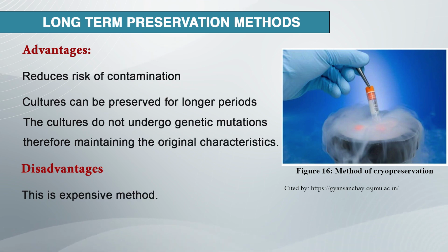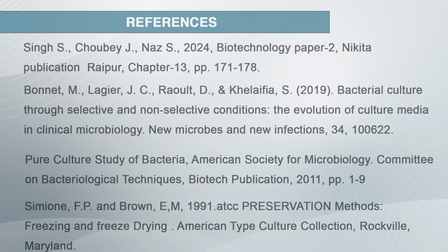Advantage: the cultures do not undergo genetic mutation, therefore maintaining the original characteristics. Disadvantage: it is an expensive method. Reduced risk of contamination. Cultures can be preserved for a long period. These are some references.